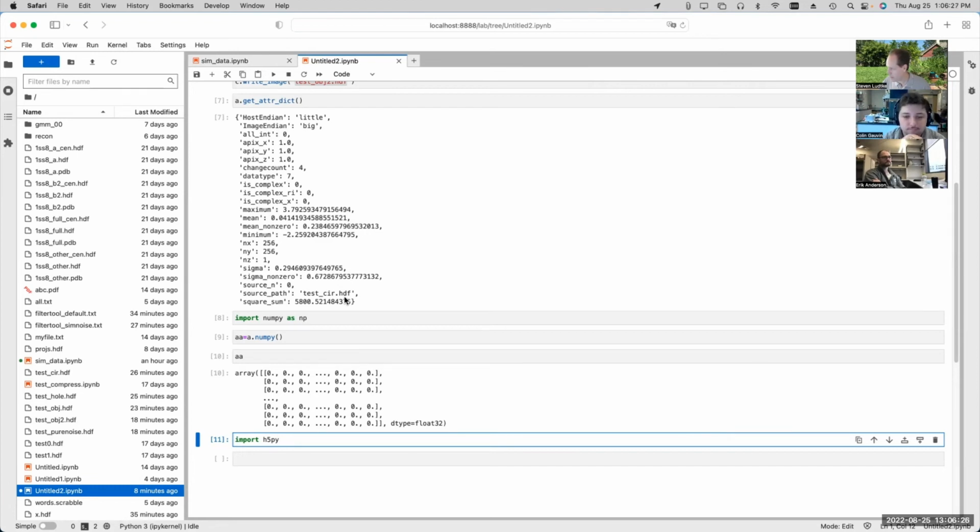So if you look at MRC files produced by IMOD for about a 15-year period of time or something like that, they use the opposite of what the MRC standard actually was supposed to say. And he tried to mitigate that problem later on. So any proper MRC reader also has to be able to try and detect those files that have signed data where it should be unsigned and fix it. Anyway, it's just a nightmare.